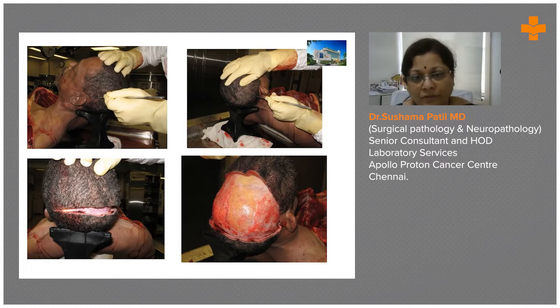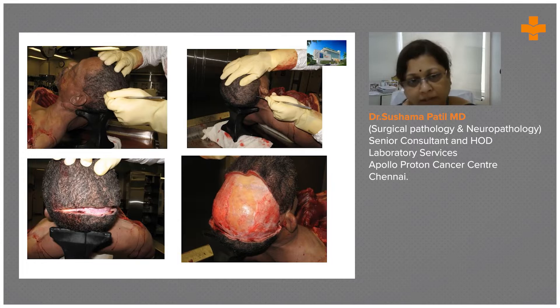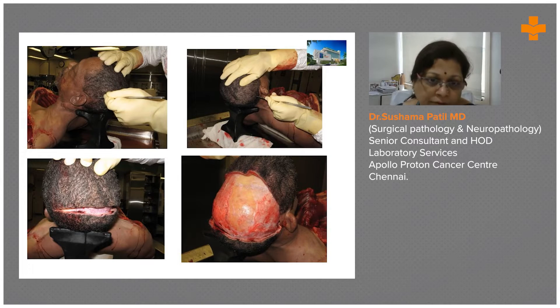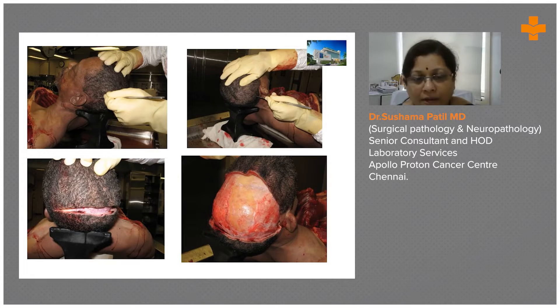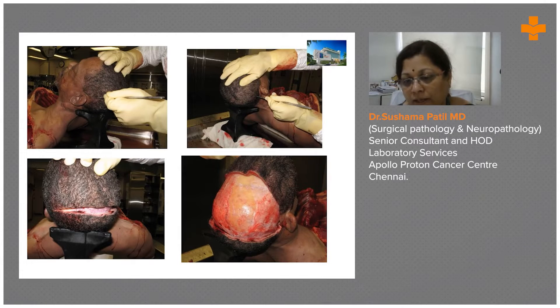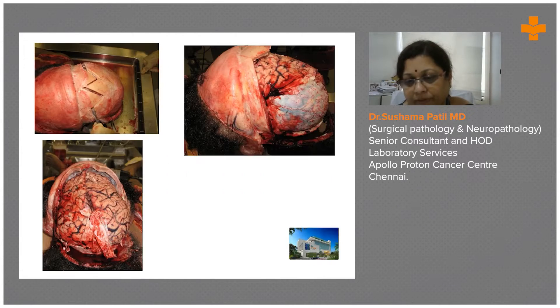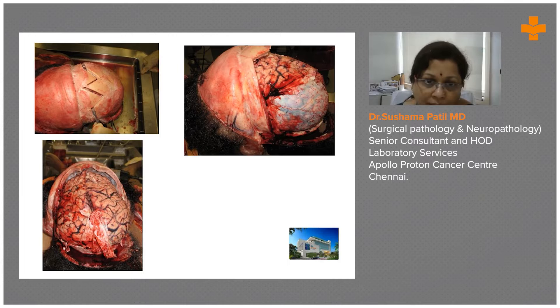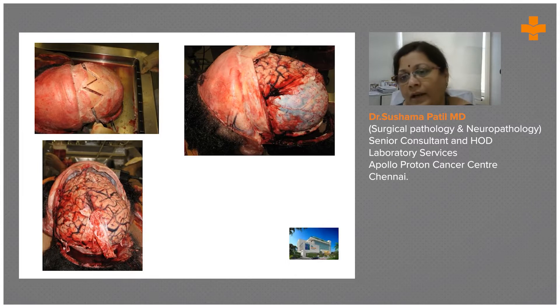Here is a quick recap using one of my autopsy cases collected when I was a fellow. We are harvesting the brain here. The first incision goes from one ear to the other and you can see the scalp being reflected anteriorly and posteriorly, exposing the underlying skull. Then we saw the bone in a W or M shape and take the skull out, exposing the underlying in-situ brain.